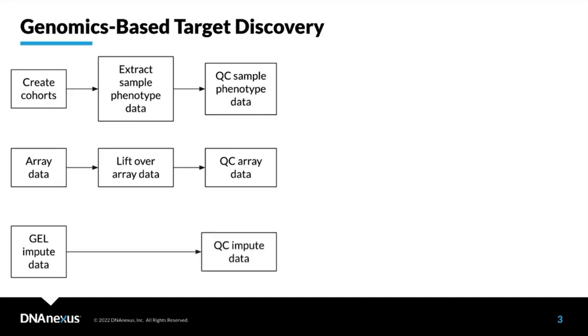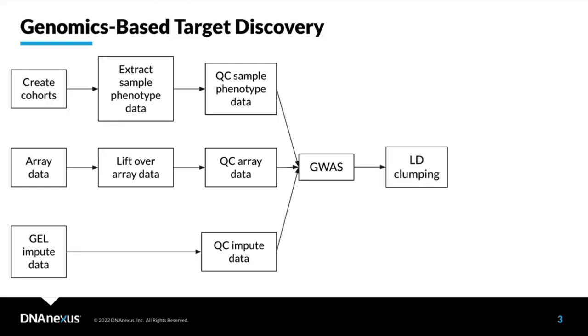You can use either TOPMed imputed data, original imputed data, whole exome sequencing, or soon there will be a release of whole genome sequencing 200k PGEN files. In our case we'll use imputed data. Once we have all three types of data cleaned, we'll do GWAS using the REGENIE package, then aggregate results and select the most informative variants using linkage disequilibrium clumping.